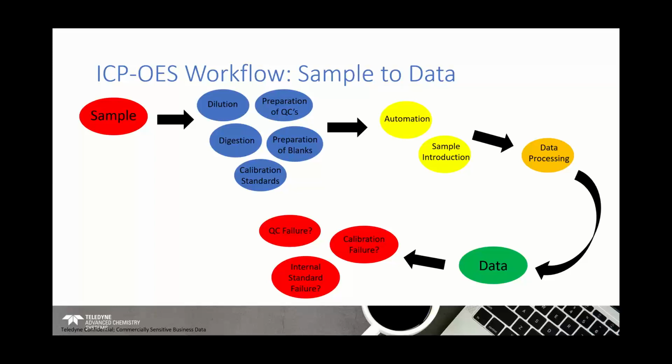If we have a batch analysis, which is quite a large batch, and we might have 10 QCs, is there a criteria for pass or fail here? You might have a criteria where, if you have 8 QCs that pass out of 10, that might be an acceptable batch analysis. So these are questions that we ask.